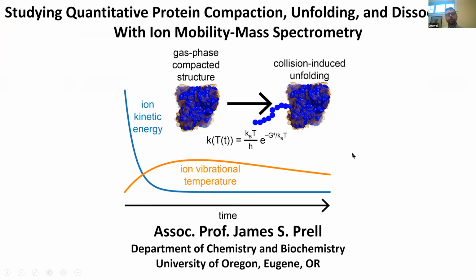Today I'm going to tell you a little bit about what my group does, combining ion mobility mass spectrometry experiments with molecular dynamics simulations, as well as collision theory, to try to learn more about the structure of protein complexes.